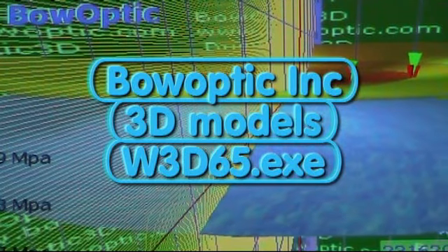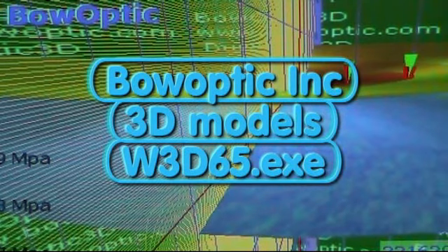Model is built with every scan from the BowOptic 208. The 3D model is a pixel-thin 3D image of the wafer surface. The Scan 1 image and Scan 2 image can be loaded together to see how the deposition has changed the wafer.